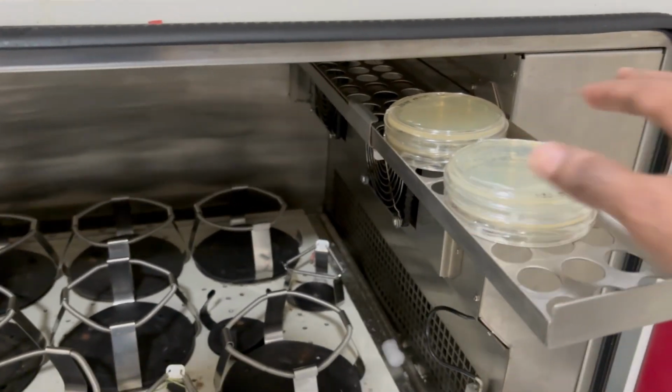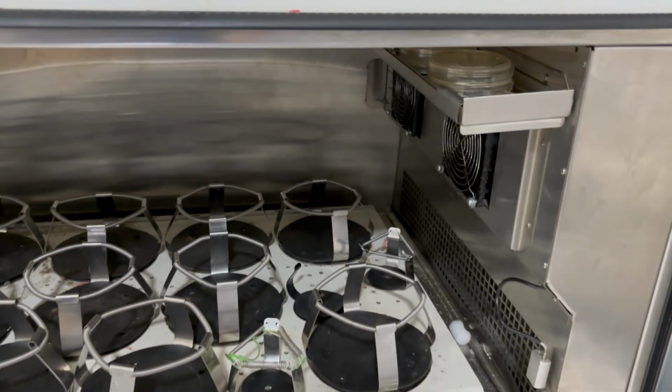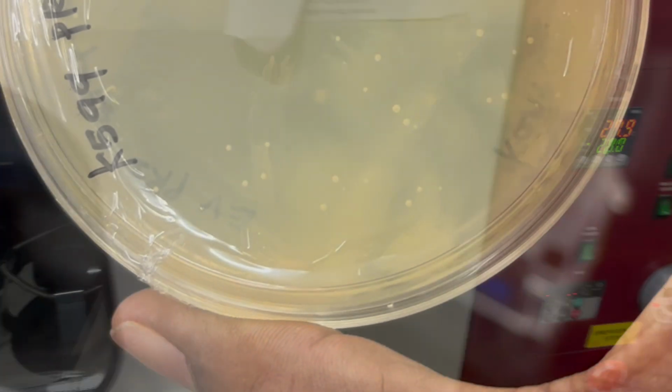And after 2 days you observe the colonies on the plate, and those colonies you can further screen by colony PCR.